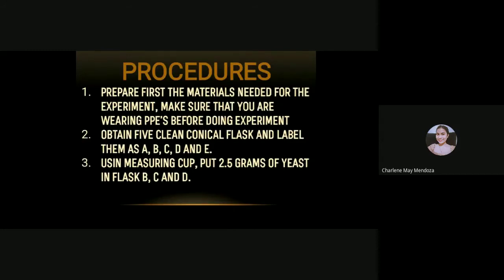So this is the procedure. First, prepare the materials needed for the experiment and make sure you're wearing PPEs. Second, obtain 5 conical flasks and label them as A, B, C, D, and E. And using a measuring cup, put 2.5 grams of yeast in flasks B, C, and D.